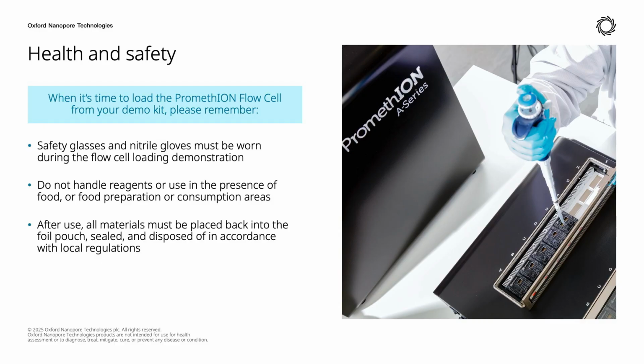After we have used all the materials today, we will ask you to please put all of those materials back into the pouch that the demo packs have come in, so that you can dispose of them in accordance with local regulations.